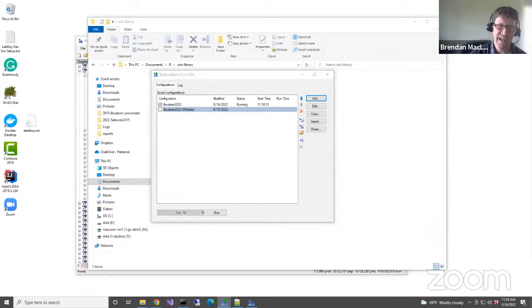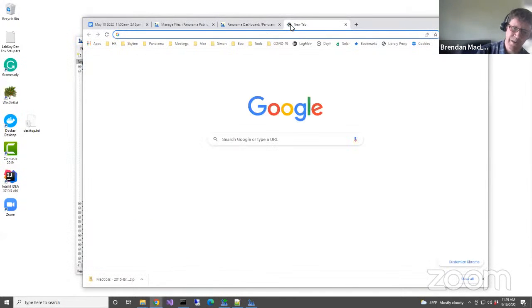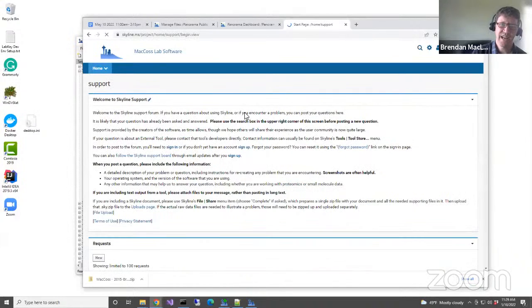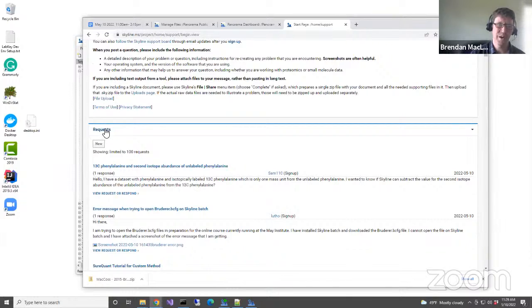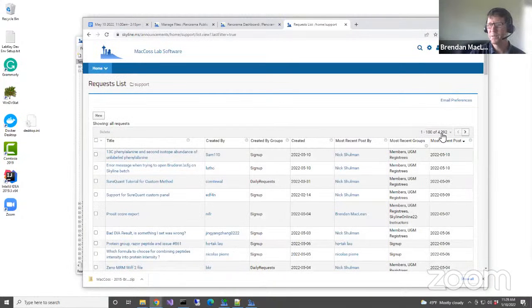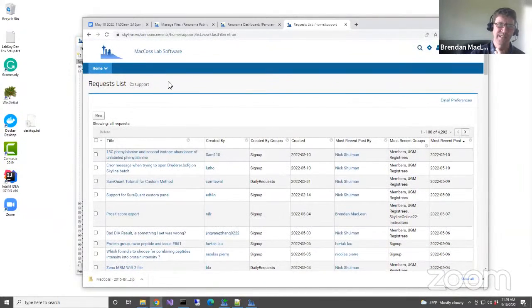If you're not familiar with the Skyline support board, most of the questions on it get answered by the Skyline developers. If you go to Skyline, actually right up here, you can click support. And then this is the Skyline support board, and we highly encourage you to post requests there. I'll try to announce this to the class as well. We answer them really quickly. If you view this list, you can see that at this point there have been over 4,000 requests answered. Nick does a lot of the support, but the rest of us chime in as well.